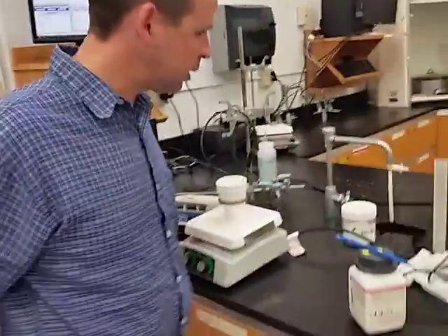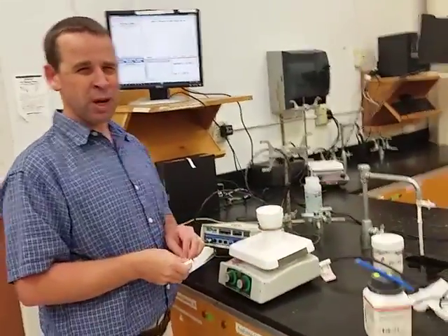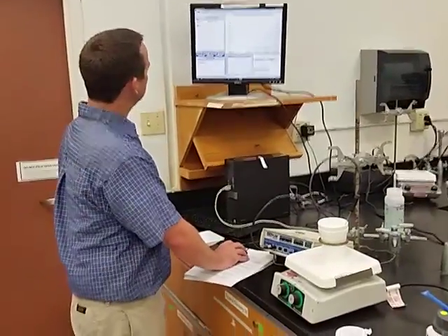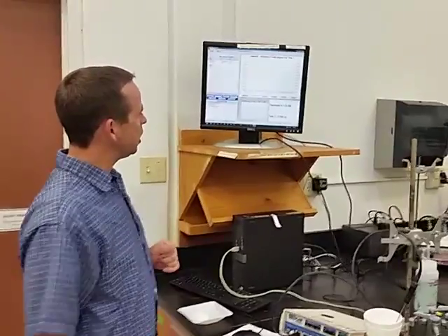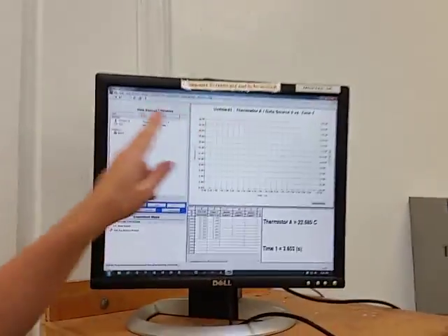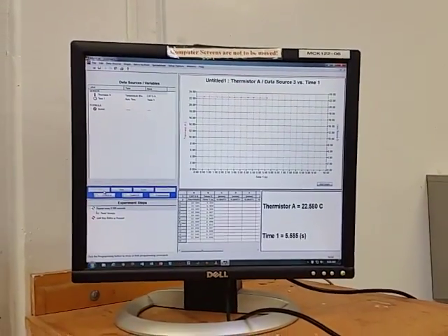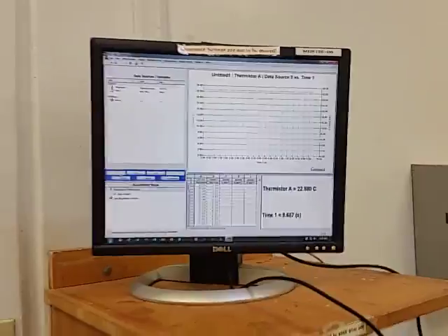Where's our lid? Do I have a lid? It's nice to have a lid on when we're done, not that there's a huge amount of transfer or heat loss through that lid. We're ready now to push start. It's good to push start a little bit early and allow a good baseline to develop, right? So that there's no doubt what the initial temperature is, which is 22.58.